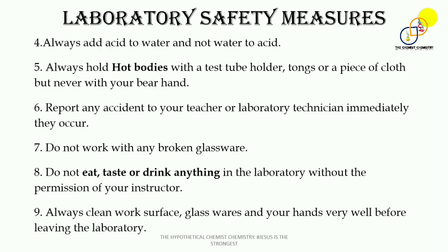Maybe there is something that he would like you to taste to see how it looks like. But if there is anything like that, please don't try to take anything, don't try to taste anything, don't try to eat anything or drink anything in the laboratory.